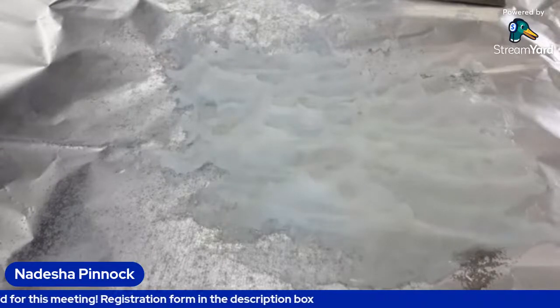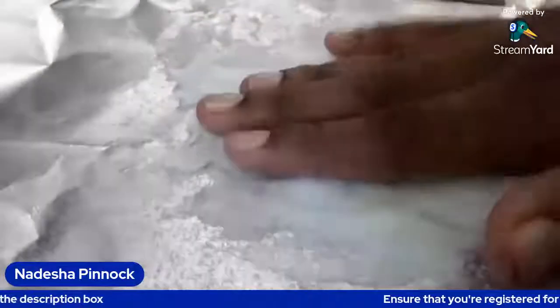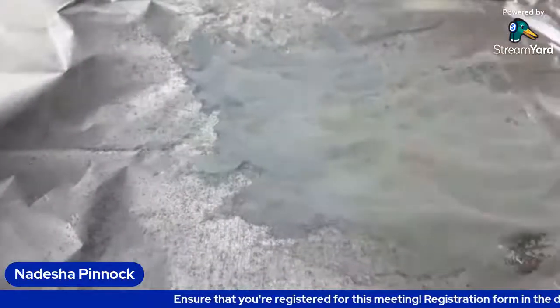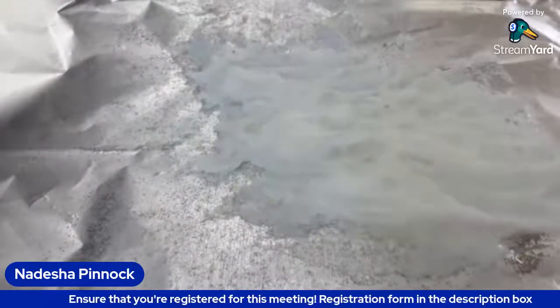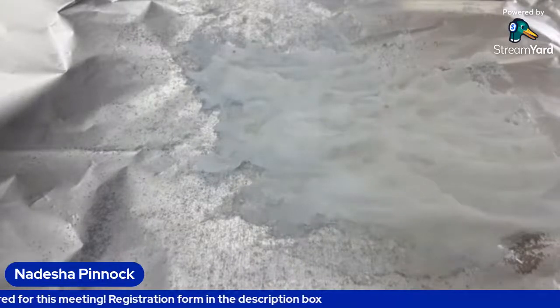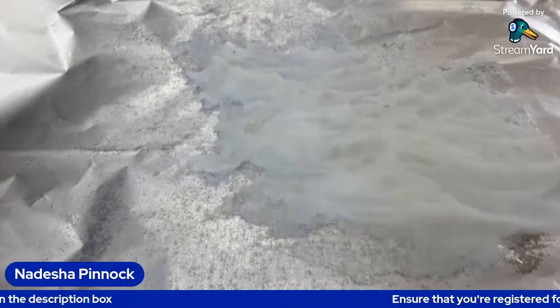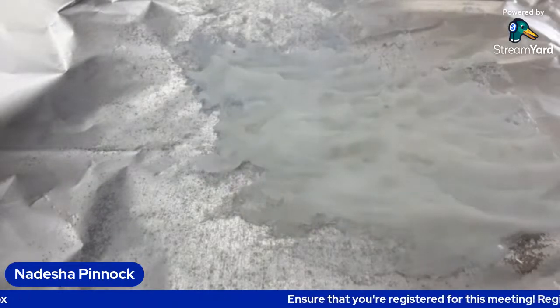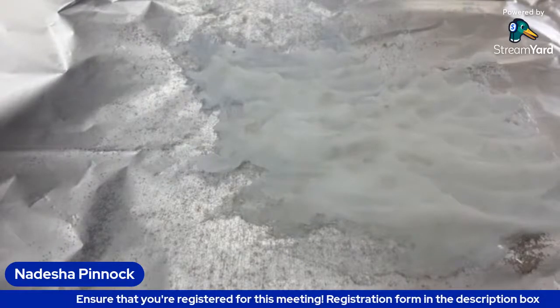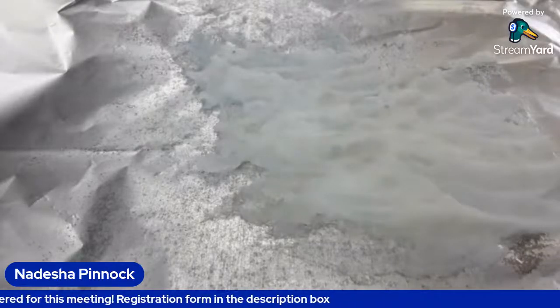So the drying process is really the longest process. It's getting harder and firmer, but the drying process takes a while, okay? And if you want to, you can add it to the microwave, which speeds up the drying so that you get your product a lot faster. That's when you do it at home. You can add it to the microwave.